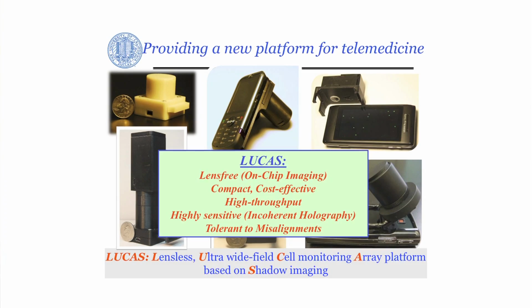So I'd like to start with actually these microscopes that you see here, either the cell phone attachment here or the standalone units, which utilize essentially as the core component the CMOS imager, the same sensor that we have at the back of our cell phones for capturing images. That's the core element here. But these microscopes are not your father's microscope. They're quite different in the sense that they work without the use of any lenses, and they're computational.